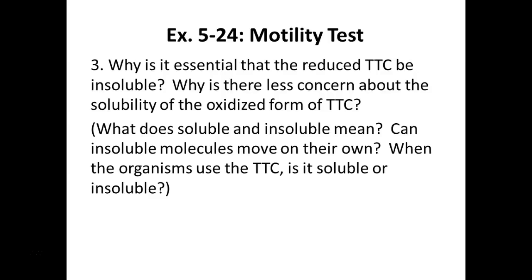Okay. So when it's colorless, in its oxidized state, it's soluble, which means where is it in the media? Everywhere. And that's what we want. We want the TTC everywhere in the media, so no matter where you inoculate, it's going to come in contact with this reagent. But when it becomes reduced by the organism growing, it turns red and becomes insoluble, which means it's not going to dissolve into solution.